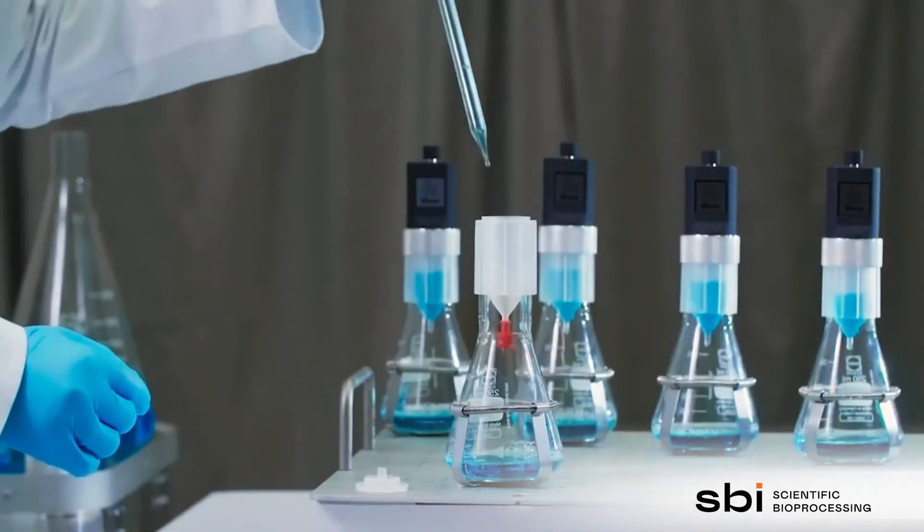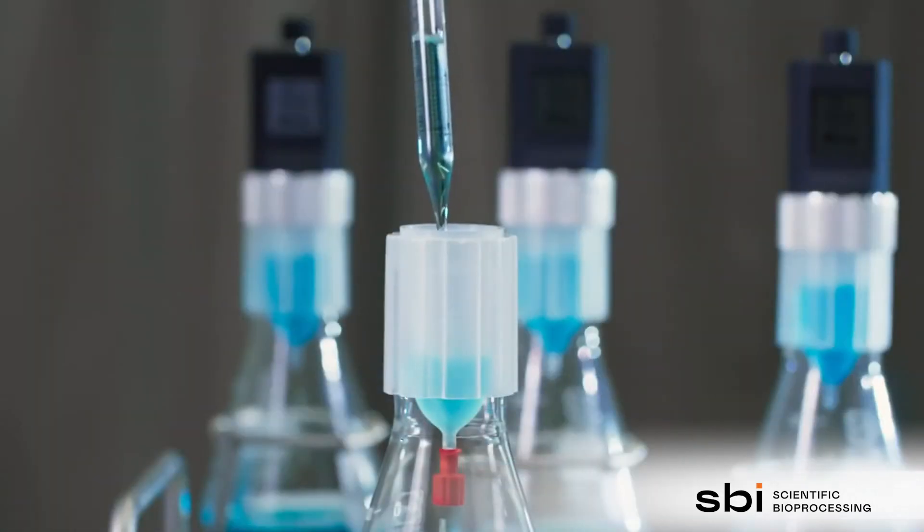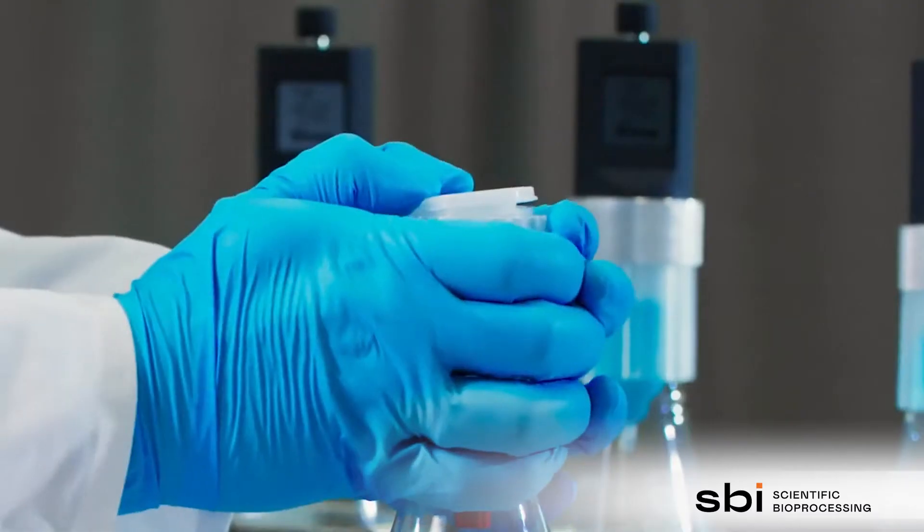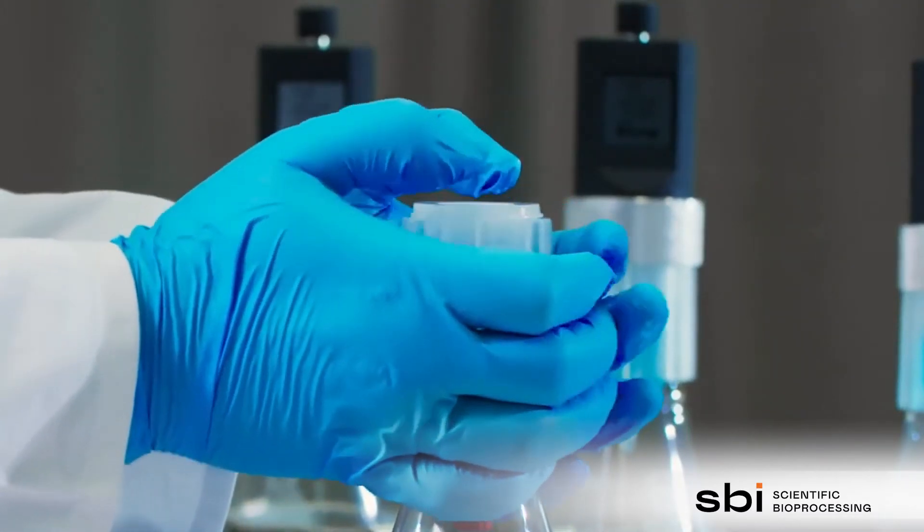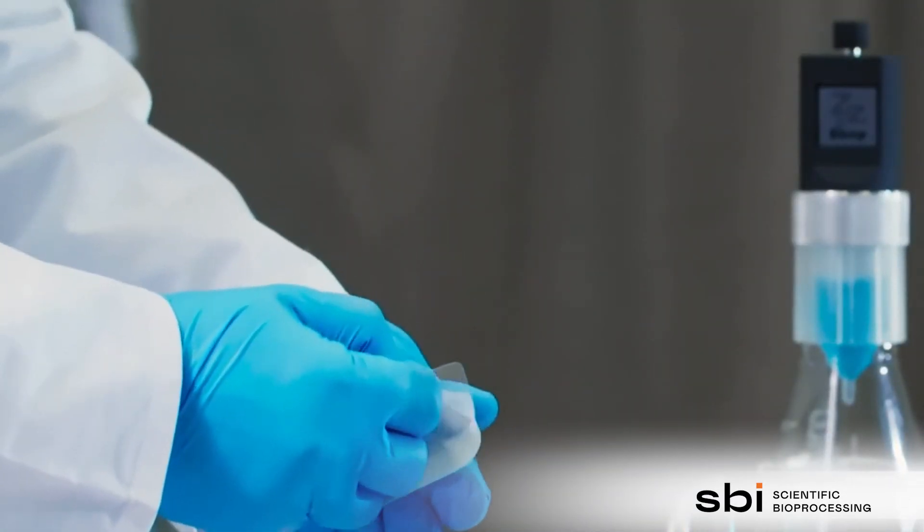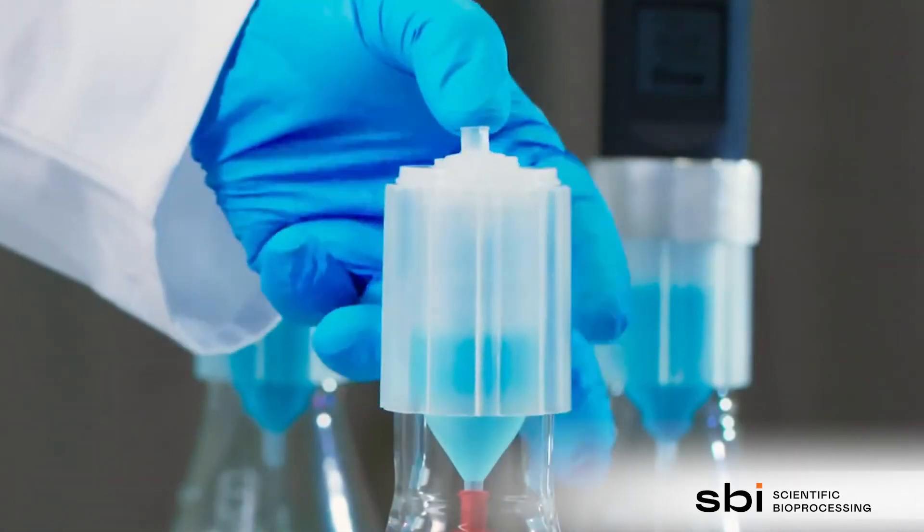It can be filled with up to 25 milliliters of the desired feeding liquid. To close the cartridge, one first needs to seal it airtight with a lid. Afterwards, it's equipped with a sterile filter to protect the liquid in the cartridge from contamination.